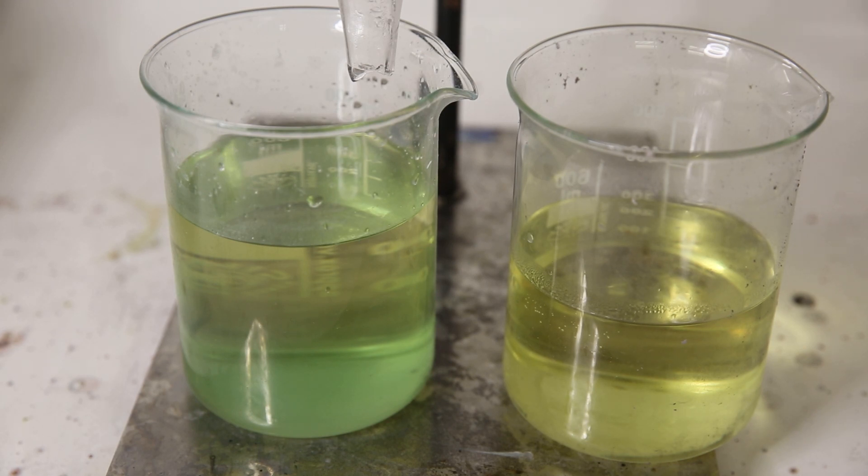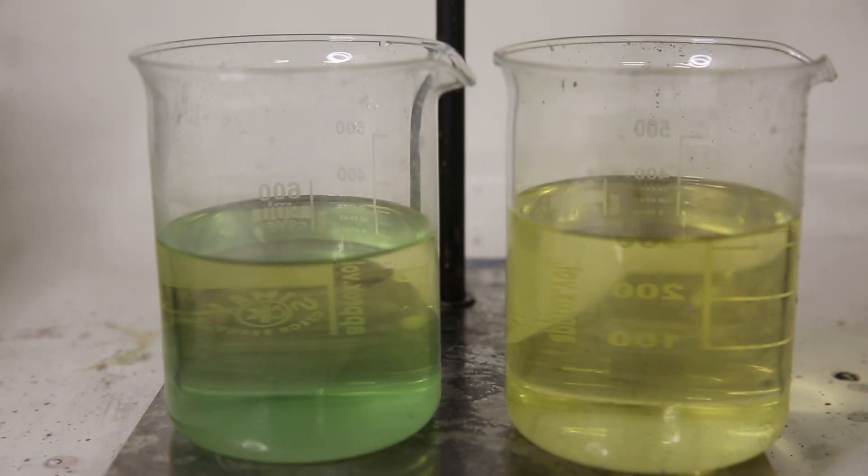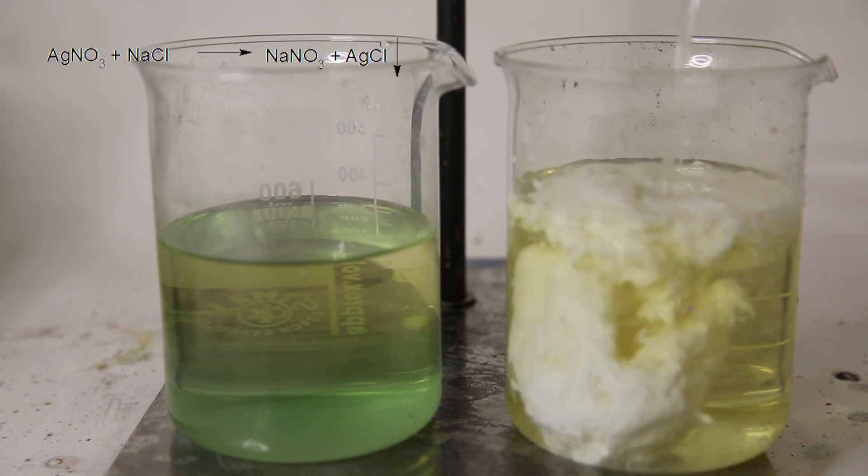In the next step, I will be converting silver nitrate to silver chloride by adding a saturated sodium chloride solution to the beaker. Since silver chloride is extremely insoluble in water, it will precipitate out immediately and we can see a white fluffy cloud of silver chloride forming.